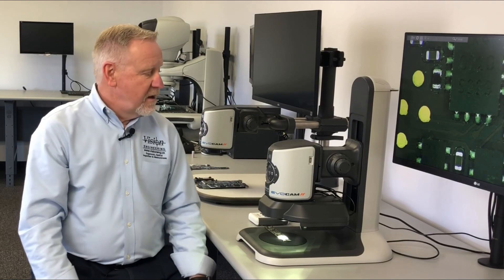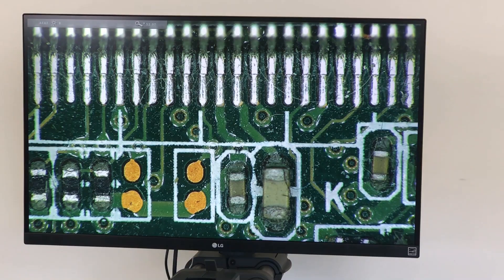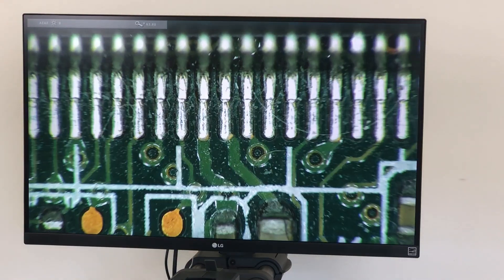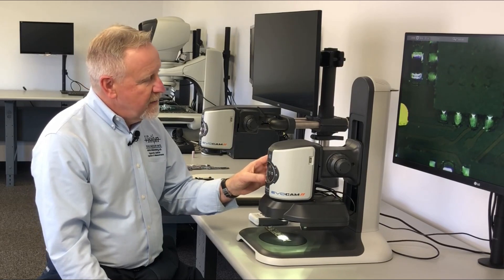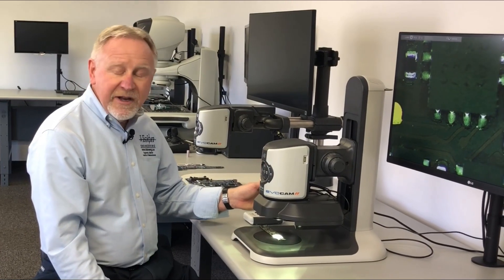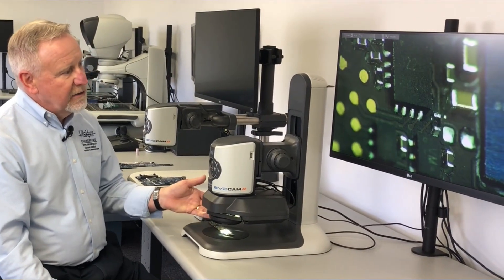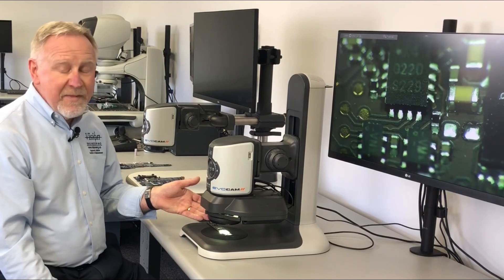To recap on the Vision Engineering EvoCam 2 digital inspection system: we offer 30 to 1 zoom, magnification range in this configuration of 16 times to 150 times, wide field of views, auto focusing, and the ability to bring in our angle view and look obliquely around features to pick up defects that may not be apparent.